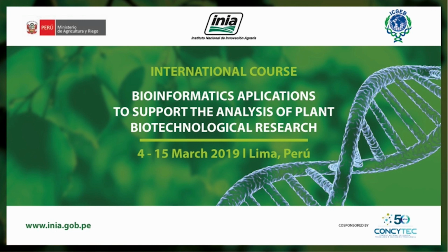If it doesn't work, you don't have to do it right now, I'm just telling you. If it doesn't work, then you probably have to install it from scratch. That's a bit more complicated, but it's nothing out of this world. We're not going to touch how to install programs in Linux, because that's out of the scope of this course, but I just wanted you to know that it's not very difficult. So in this case, you already have a prepackaged or precompiled program, which is called clustalo. And clustalo is going to do multiple sequence alignment, just like you did in R yesterday.